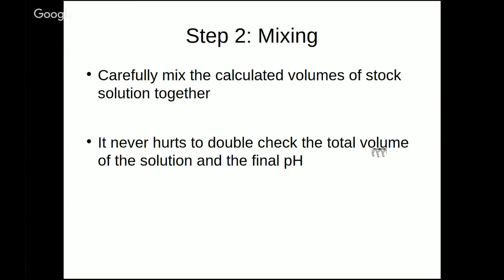There's an even easier way of making that solution with the proper amount of water. And here it is. Once you know the volumes of the various ingredients you're going to use, you can just combine those in a graduated cylinder and then just add water to it until it comes up to the final volume that you want. And that'll be 30 mils anyway, if you're measuring correctly.